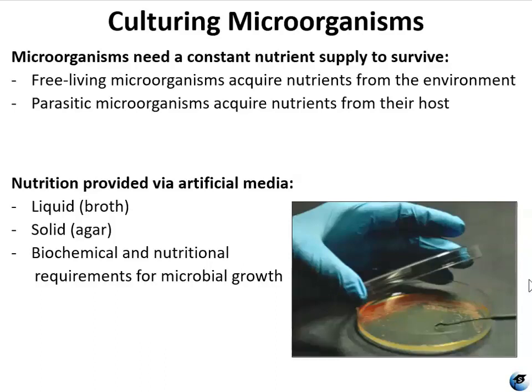Liquid broth is very useful for culturing bacterial specimens quickly. That is, the incubation is usually 24 hours or less, so it's faster than growing on a plate. And that is a pro, right? But a con of that situation is that the bacteria will deplete the nutrients in a broth more quickly than they would in an agar. So it grows fast and it also dies fast.